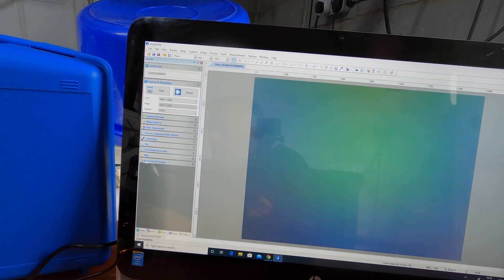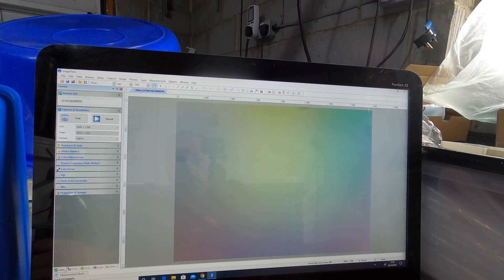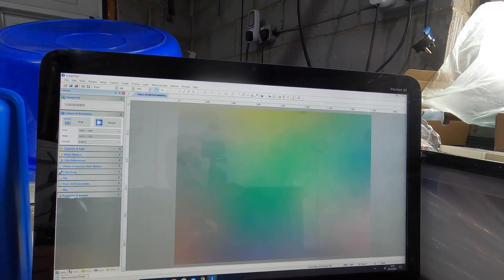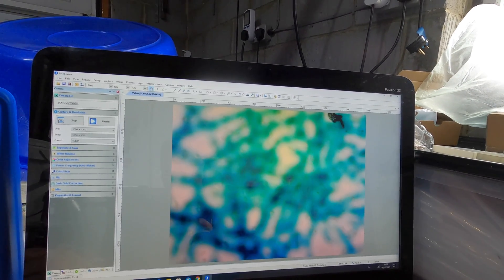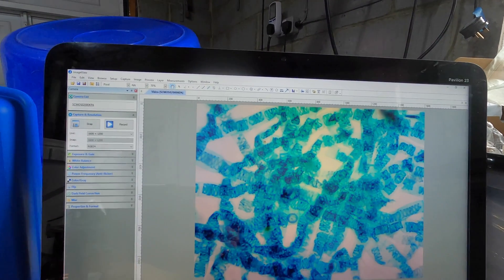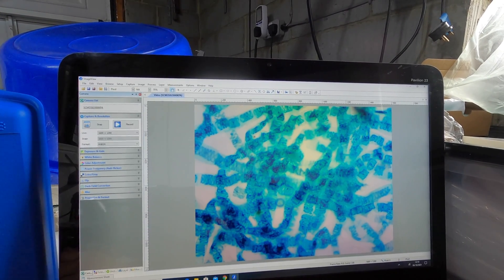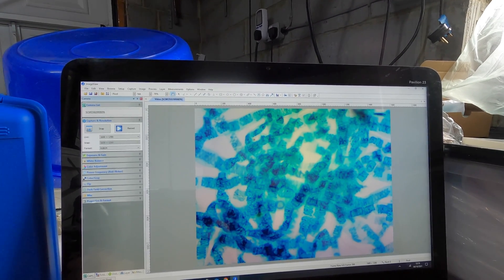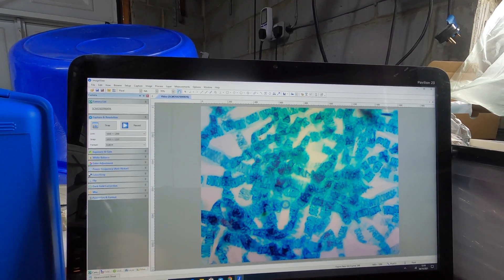Straight away you can see we're not getting much of an image — that's just light — then you move to the microscope and start doing your adjustments. A bit of fine-tuning and there you go — that's showing the algae. That's at the minimum, on 40x with the Mini Grab, and you can really see the detail in that.